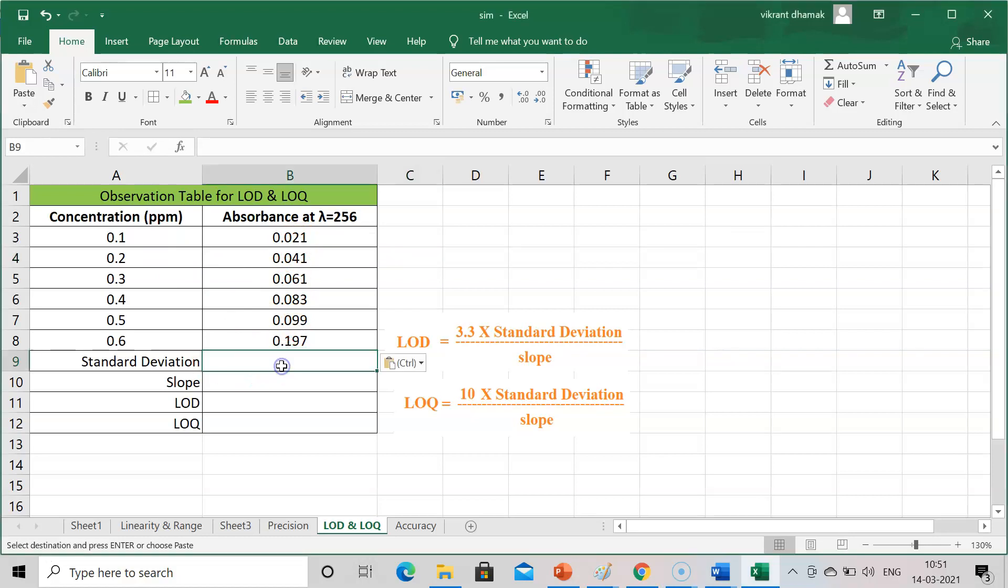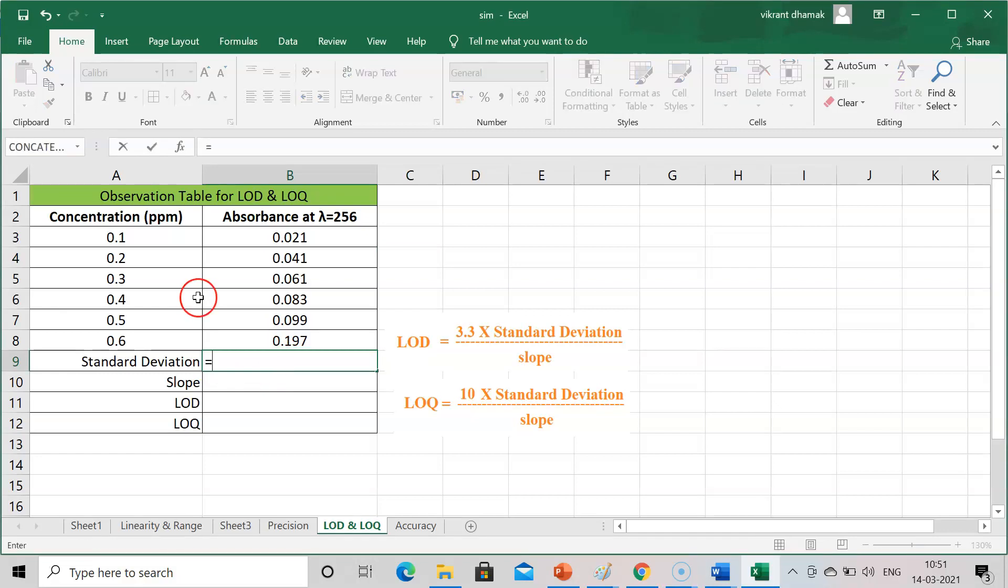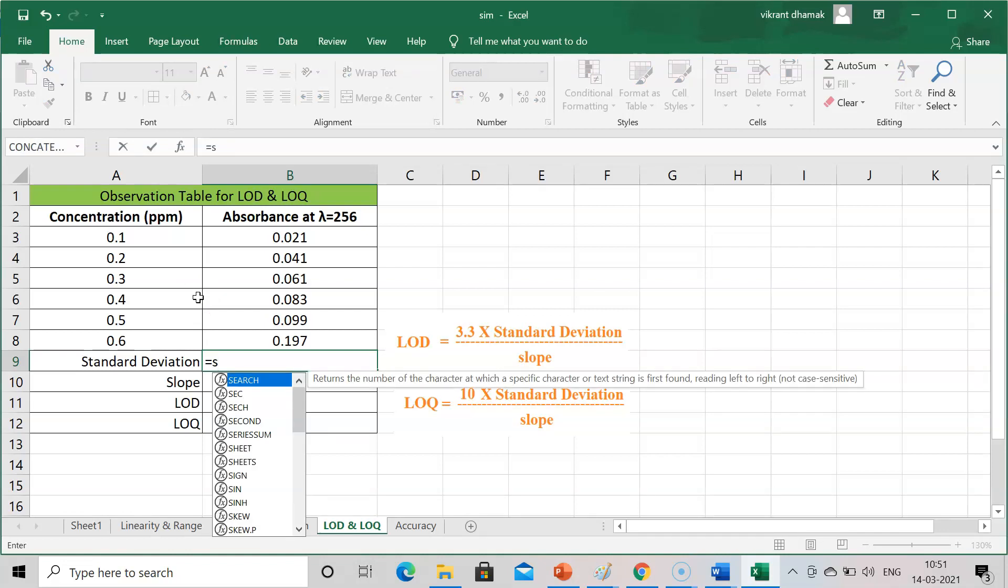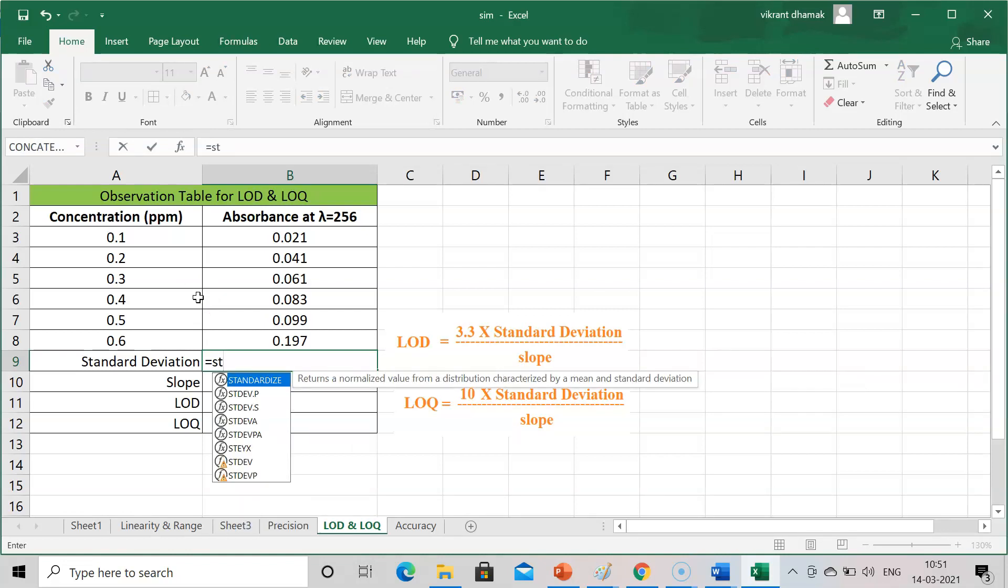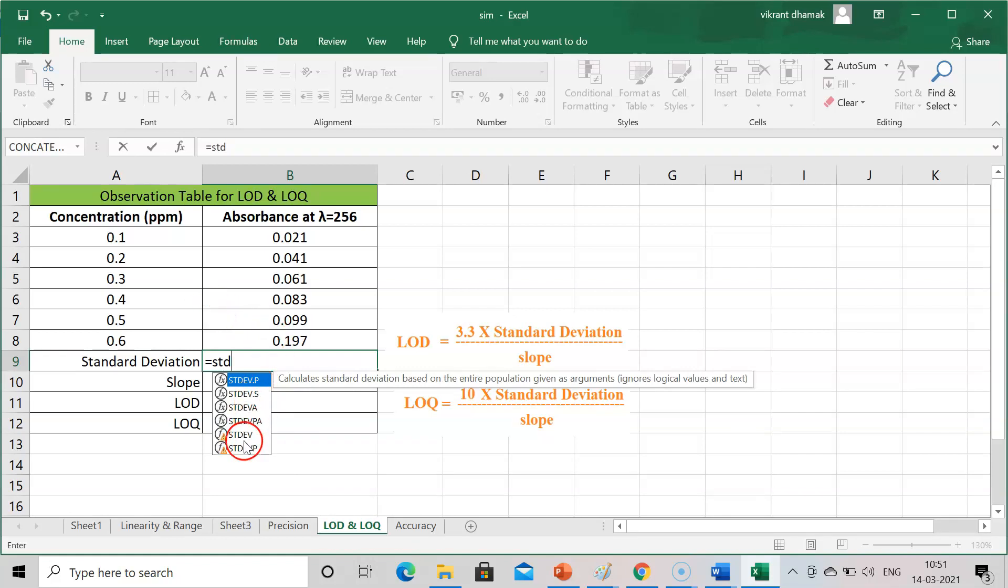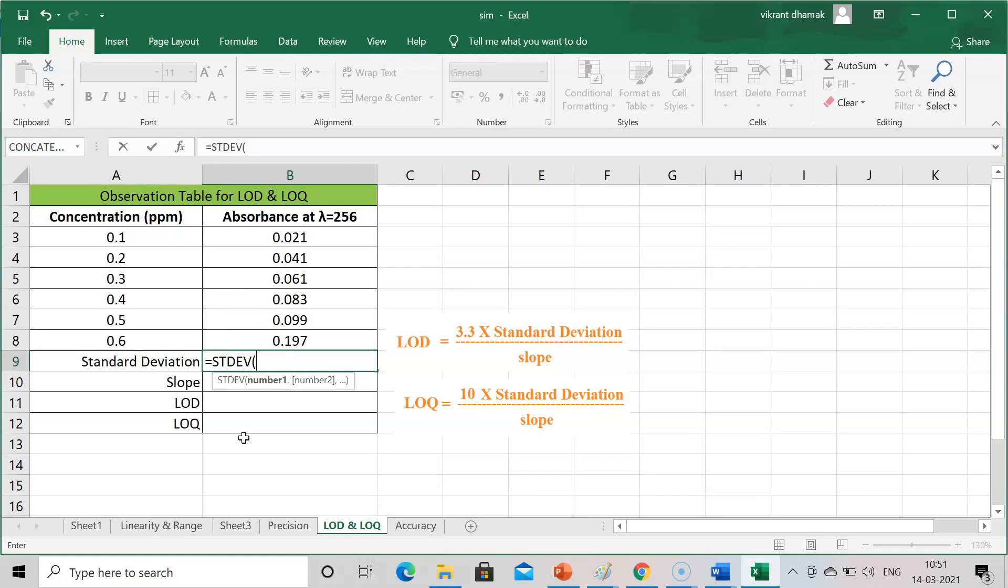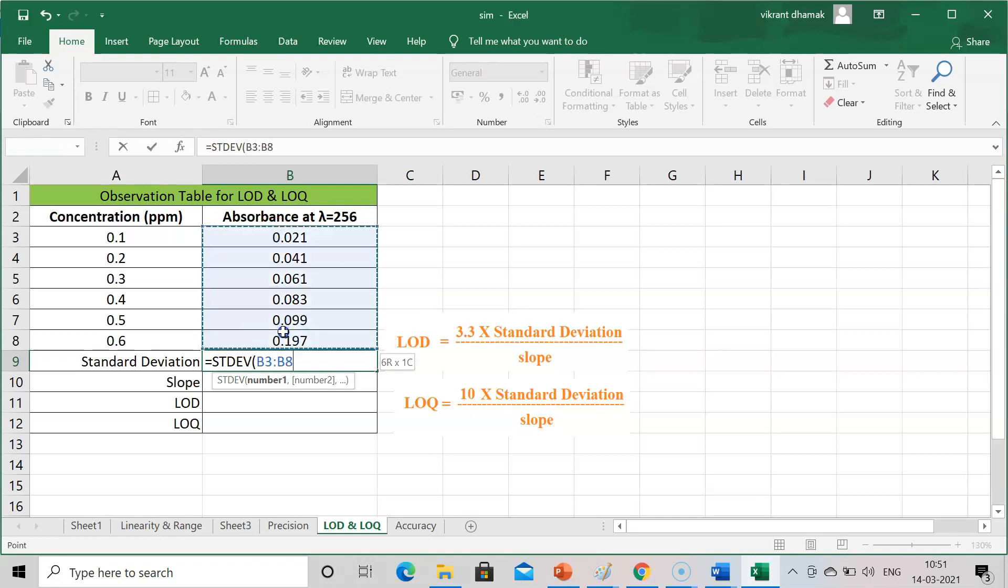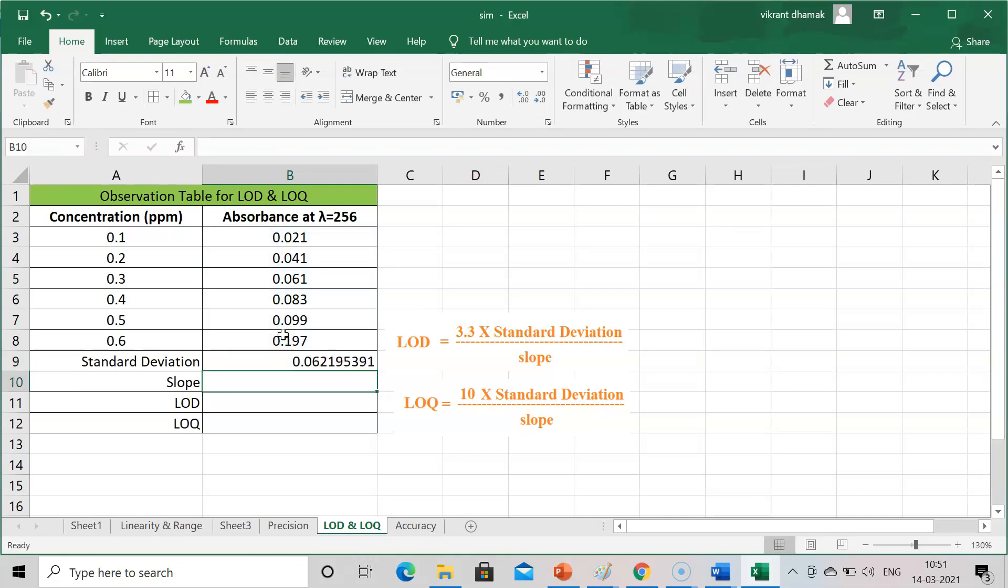After that I need to calculate the standard deviation. For calculation of the standard deviation, press equal and then press STDEV. Now select the cells. This will be the value of standard deviation after pressing enter.